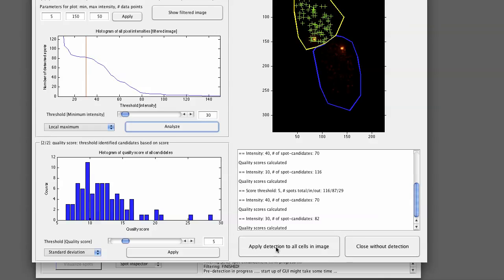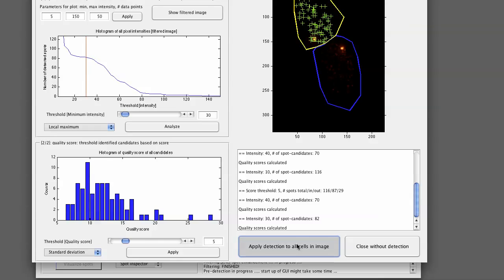And then you can simply click on Apply Detection to All Cells in Image. And those detection settings will be applied to all the cells that are present in the image. If you want to close this interface without doing anything, you can click on Close Without Detection. Nothing will be done.